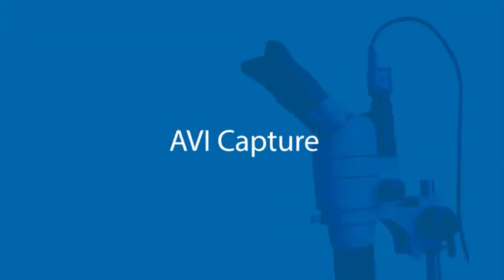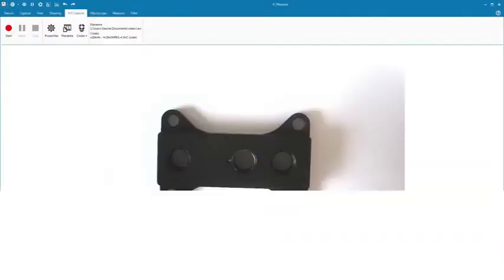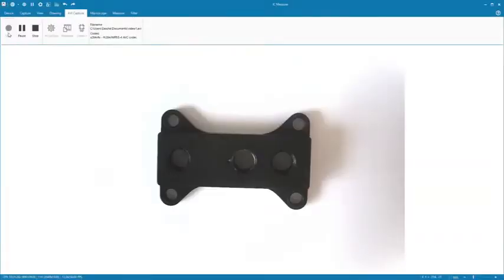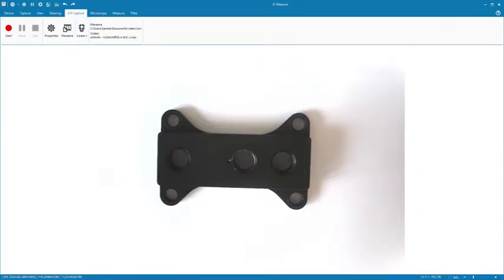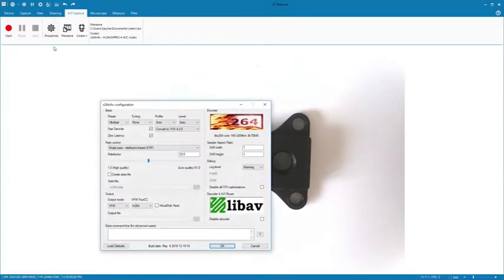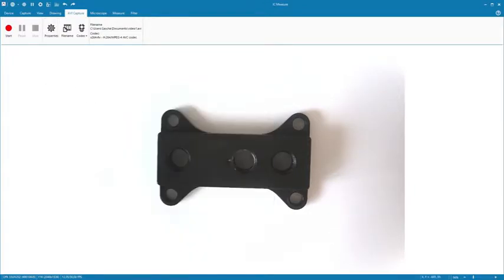You can also record videos by clicking on AVI Capture. Start by setting a codec. You can export the recording as a lossless AVI file or use another codec. Here you can define additional specific device settings.